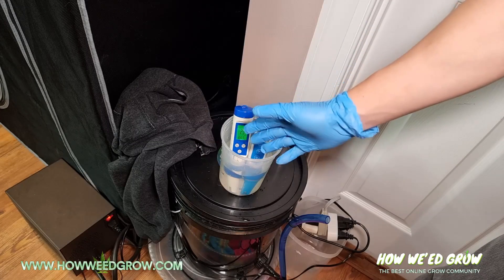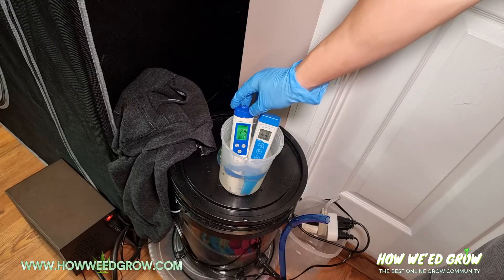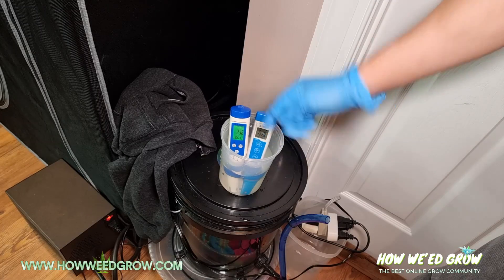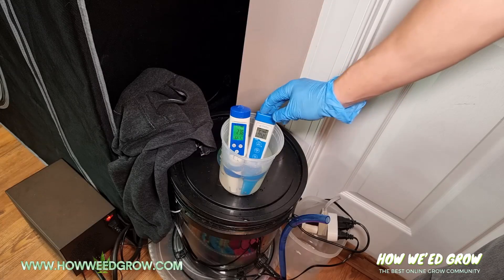If it's RO, reverse osmosis, or distilled water, it'll probably take about three minutes for the reading to stabilize. For nutrient and tap water, it only takes about 30 seconds.